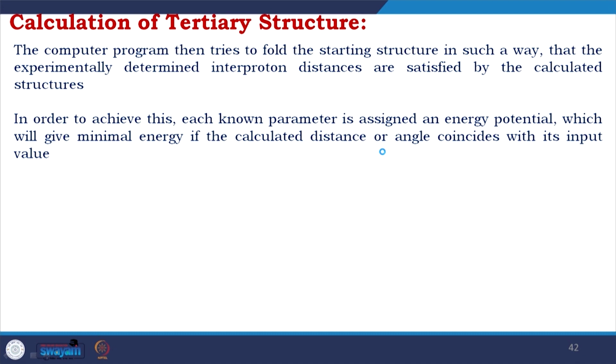So, this is what I explained very elaborately in X-ray crystallography, that is called refinement. In X-ray crystallography, because you are getting the structure directly, you have the software where you have the geometry and other information together. So, you do energy minimization to fit the manually developed model.